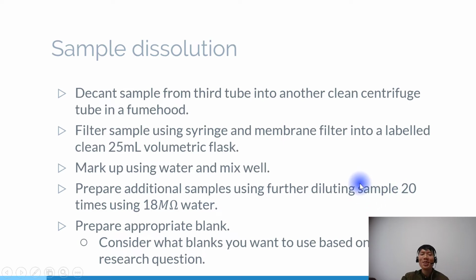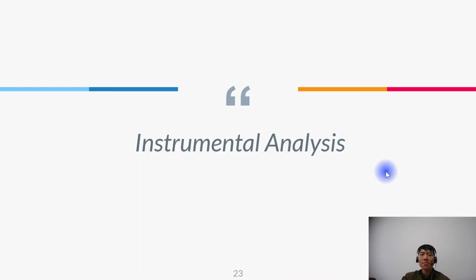Next time, go to the advanced analytical lab. Please ask the lab technicians, have a look. Okay. Do the same thing, right? And then always prepare blanks, but which blanks you want to use is dependent on the research question. Okay.